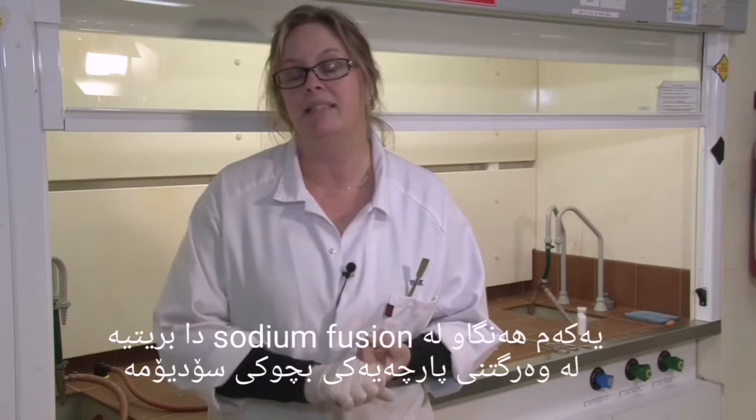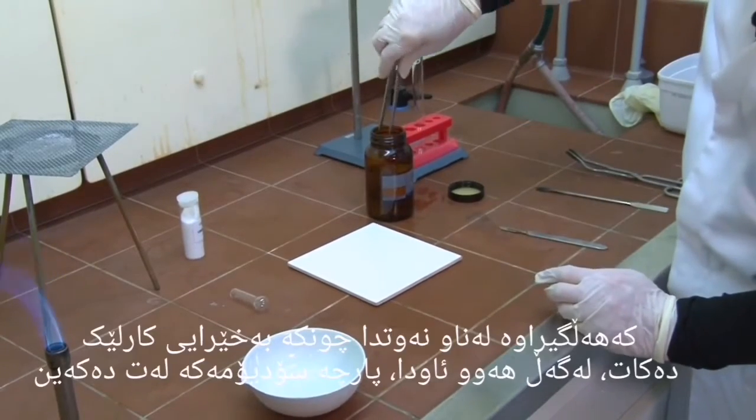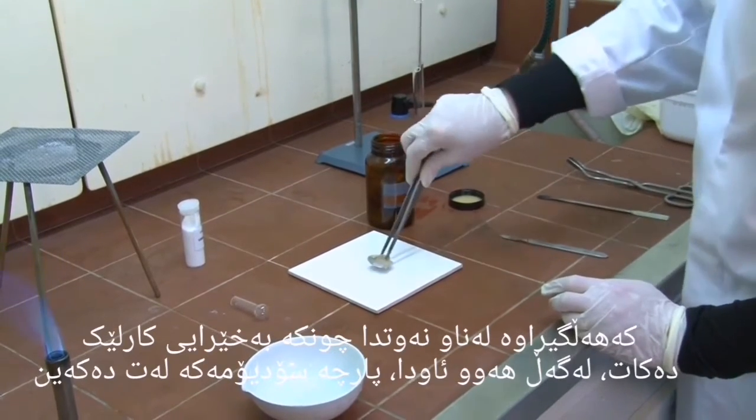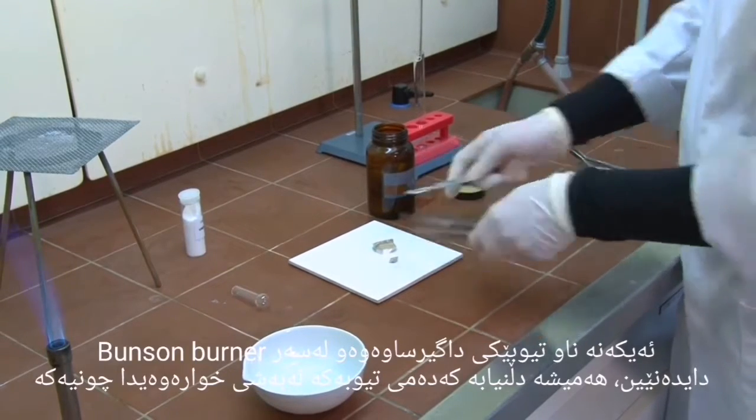The first step in the Lassaigne's test is to take a small piece of sodium. We always store sodium under paraffin oil because it reacts with air and water. Cut off a small piece of sodium about the size of a pea and put it into the ignition tube.